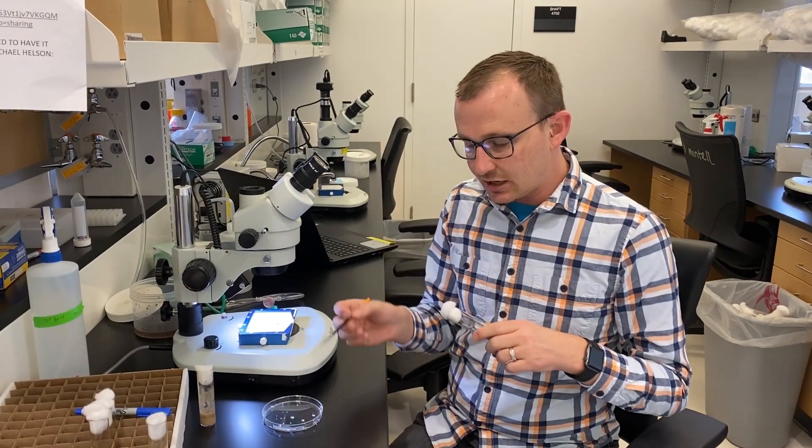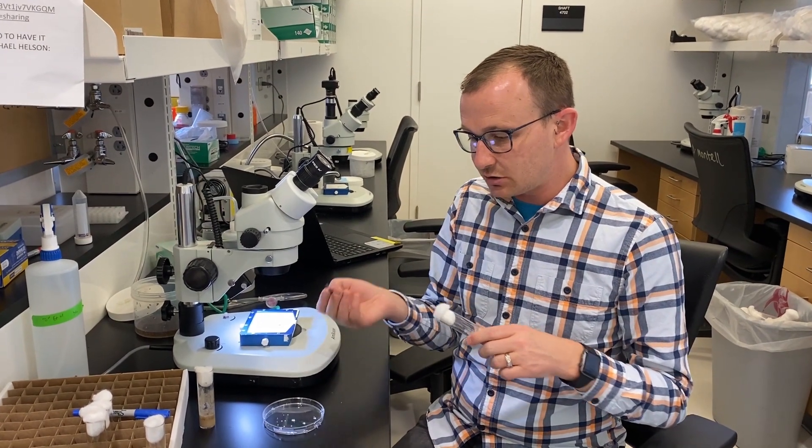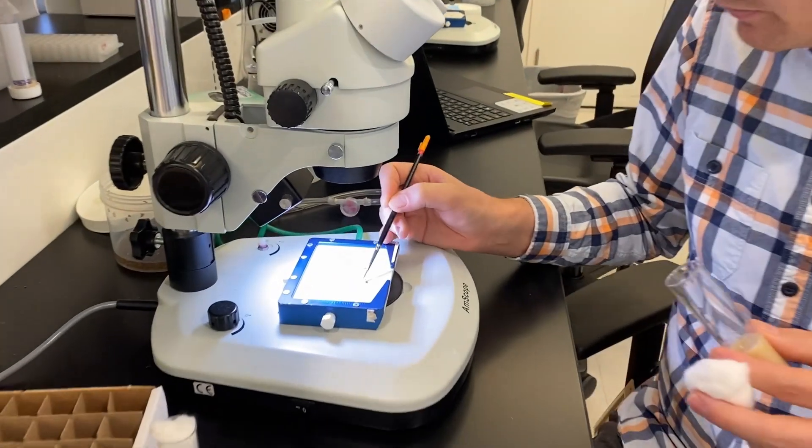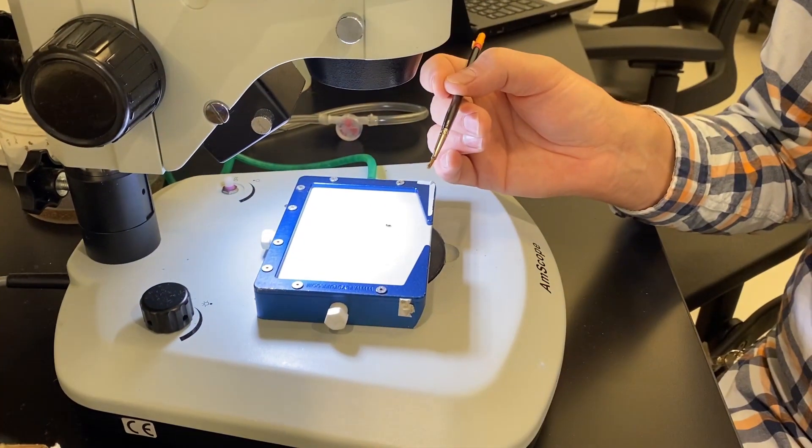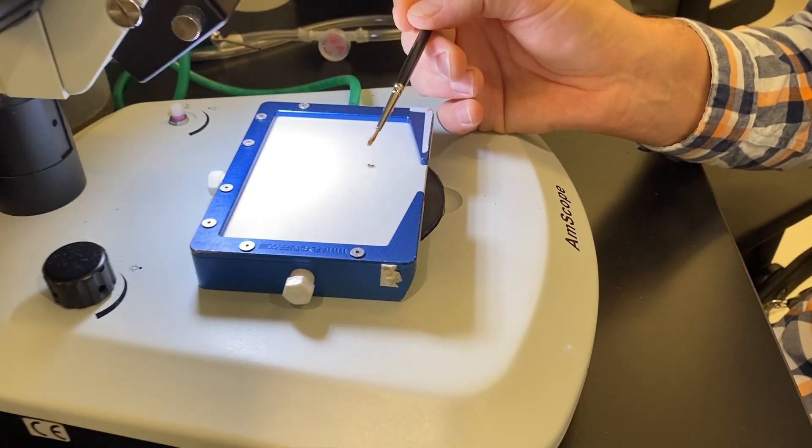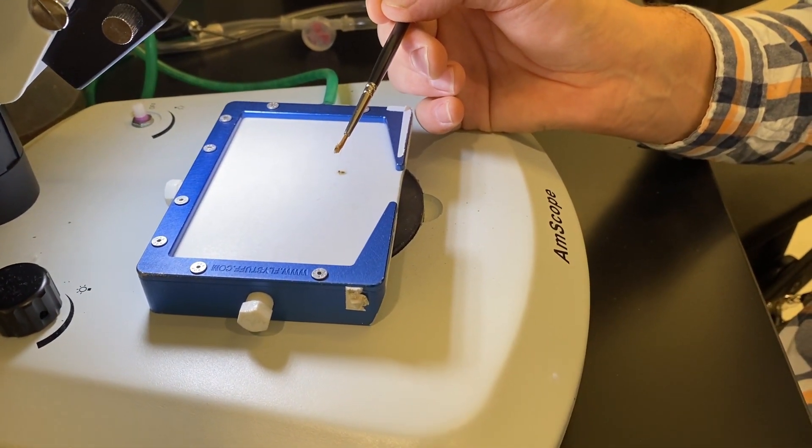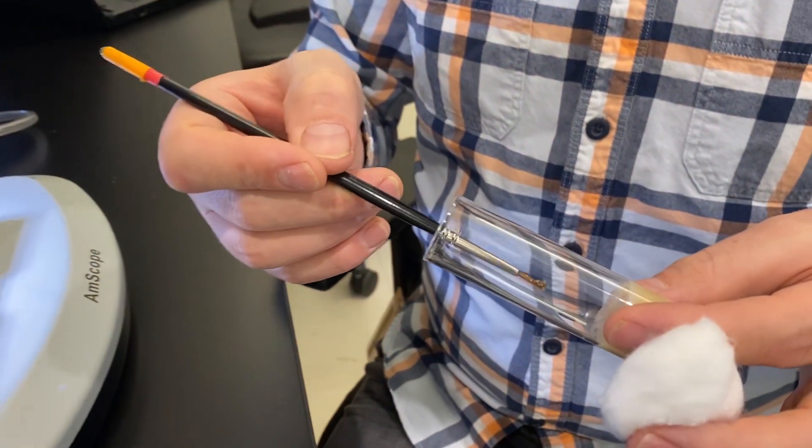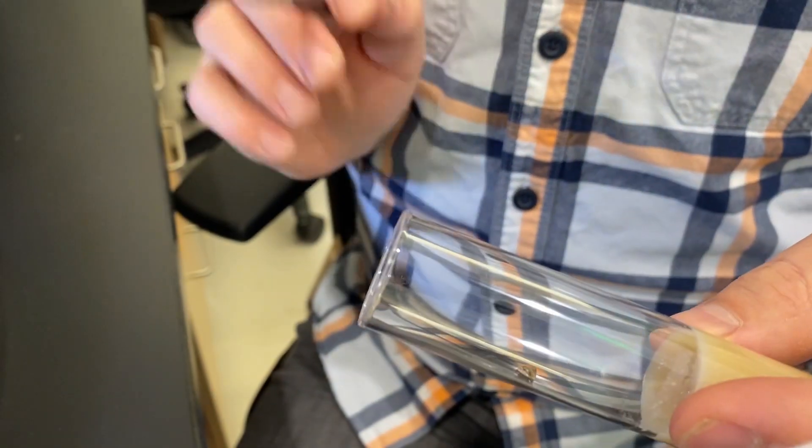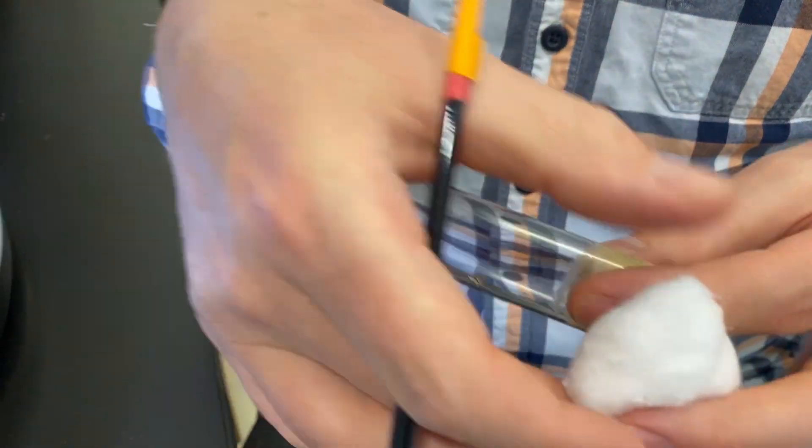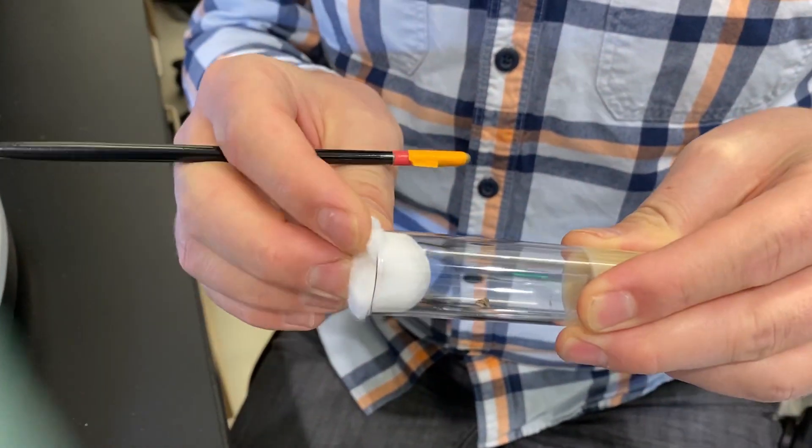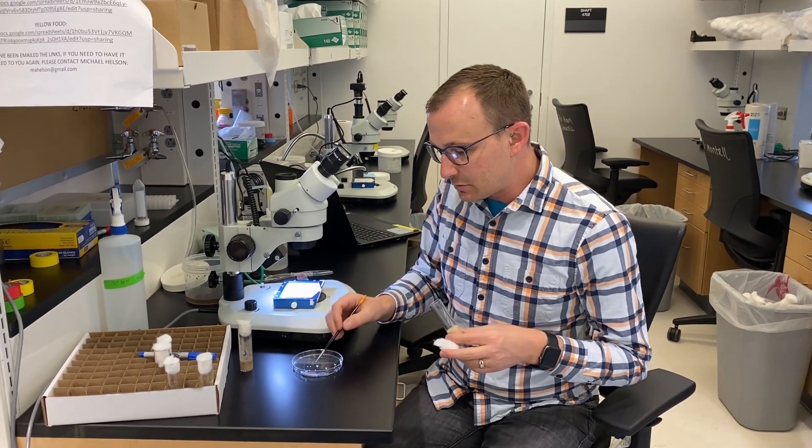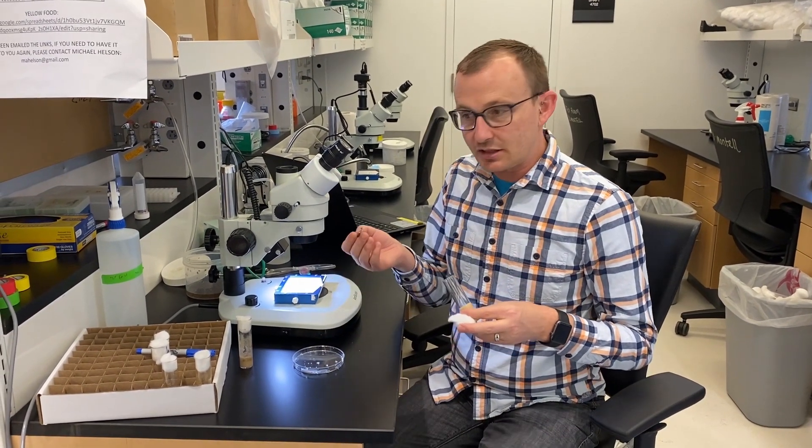So again, maintaining the wet paintbrush, you can go ahead and just pick them right back up. Sometimes I do this all at the same time. So I've picked up all three virgin females. And then what I can do is I can go ahead and just put them right onto the wall of the new vial very gently. And then go ahead and put them in there. Alright.